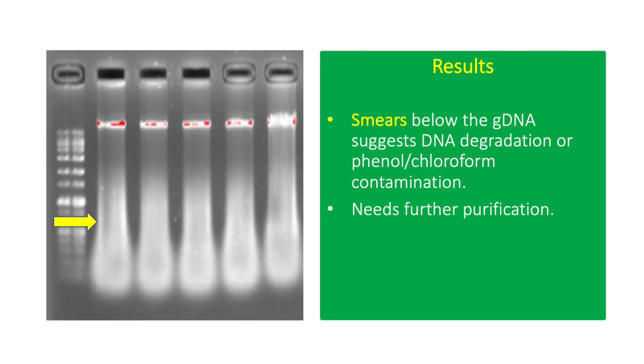This result shows low-quality GDNA with smears, which indicate DNA degradation or Phenol-Chloroform contamination. Low-quality DNA can significantly affect downstream applications such as PCR.